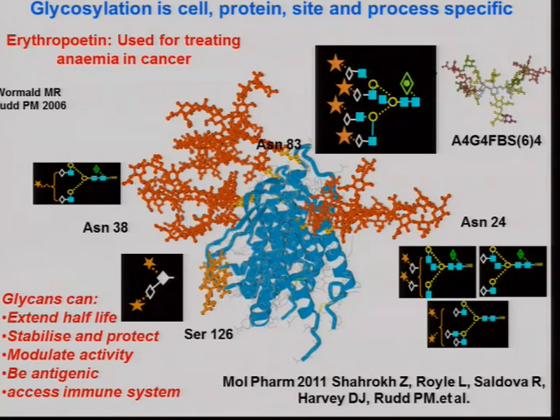I'm thinking more on the culture side. How reproducible are the cultures? The glycosylation profile that you get when you use the same culture conditions over and over again? Oh, I see. Well, I don't have a lot of data on that because we don't have those samples. But whenever we've done it, it makes sense. When we did the 20-day study, the amounts were all similar, and you could just see the rise of one peak and the fall of something else that matched it. So throughout a culture, it looks stable. If you do the same culture over and over again, I think you'd have to go to a pharmaceutical company, because the most we see really are the end products. They don't give us all the different culture stages. So I don't know how stable the cultures are.